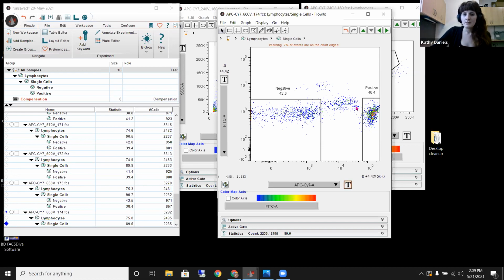And similar to what Derek mentioned before about the stats and everything like that, you also can wind up with multiple intensities of your positive. So as we see here, we have this moderate and this high CD4. If all the positives were off scale, we would just be able to get a number of percentage, right?